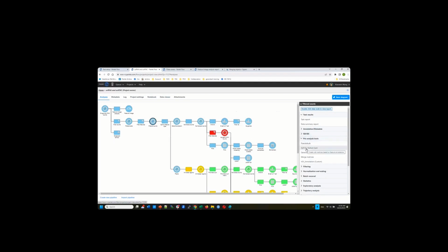Okay, so after I clean it up, the next step, if you have two assays, is to choose split by feature type, because Cell Ranger detects two feature types: one is gene expression, one is called a peak. If you just click on this button, that will automatically separate the features. Now if I mouse over, for gene expression, we filtered quite a bit. There are only 13,000 genes, 13,000 features. For peaks, there are 82,000 peaks.